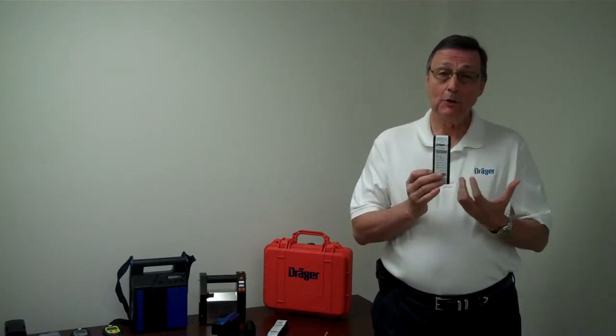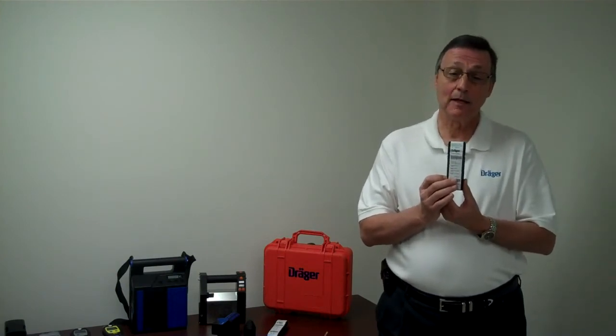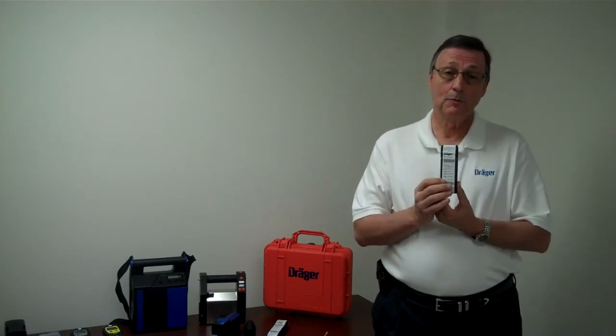There will always be ten tubes in a box, but that doesn't mean there will be ten tests. Sometimes there will be nine test tubes and one pre-filtering tube, or you may have five pre-filter tubes and five test tubes.